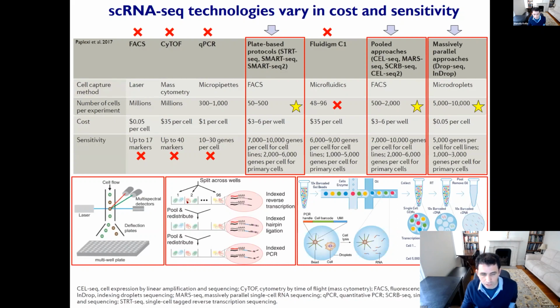And then I will add 100 different barcodes to every cell. What's really cool here is that every cell has all of its RNAs together as it travels through the first round of barcoding. You then pull all the cells together and you redistribute. You then have, for example, the blue cell shuffle, and now it gets the green barcode.